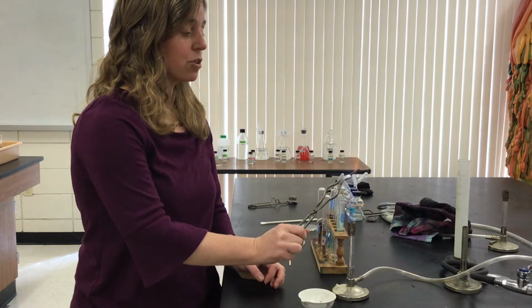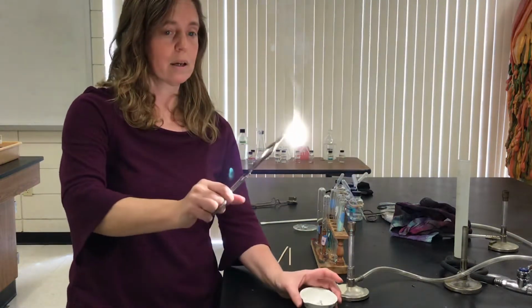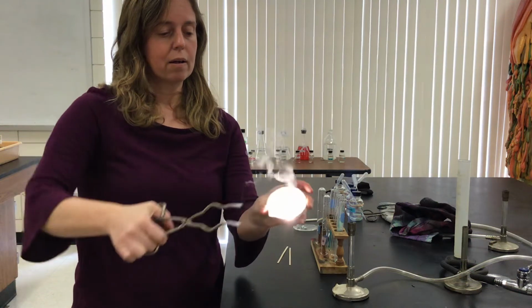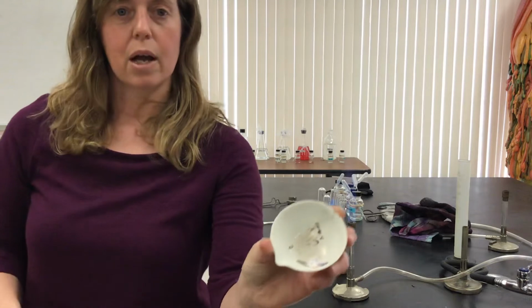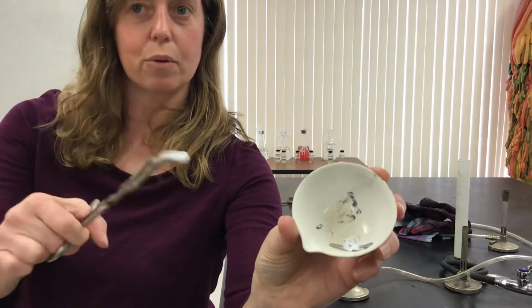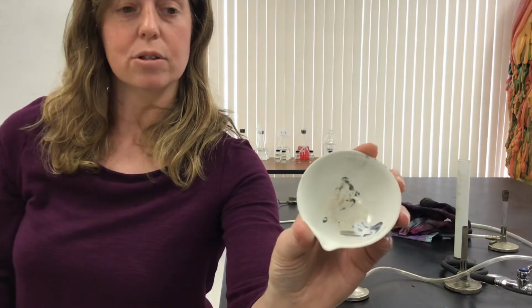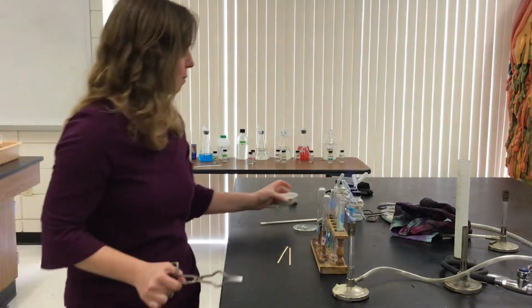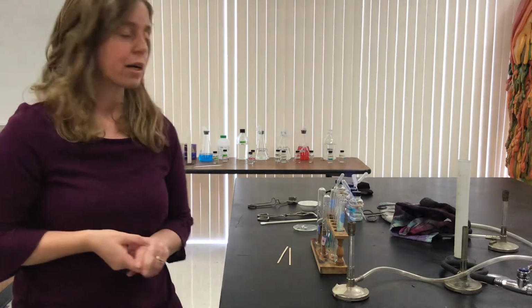So you go ahead and heat it, so you're mixing it with oxygen, okay? There you go, put it in here. It's very bright, as you can see, okay? Now I'm gonna bring it closer, and as you can see, when you're looking at this, you see the white, can you see the white powder in there? All right, that's the magnesium oxide, okay? So you're mixing this and making magnesium oxide after you heat the magnesium, okay? So that's it for my two combination reactions.